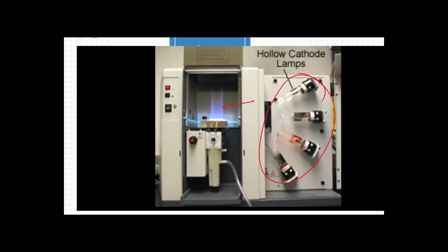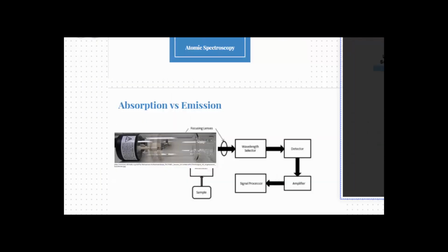Now, there are several things that can be adjusted with both the atomic absorption as well as the atomic emission for the flame kind of atomization machine. You can adjust the oxidant and the fuel in order to get a more lean or a more rich flame. And that, in turn, changes the temperature of atomization. So that temperature of atomization can affect how many excited atoms you have versus ground state atoms. For absorption, you can also adjust the intensity of the light that is produced.